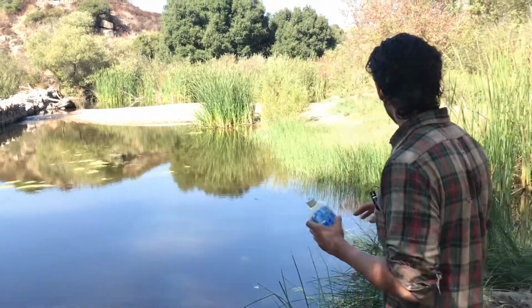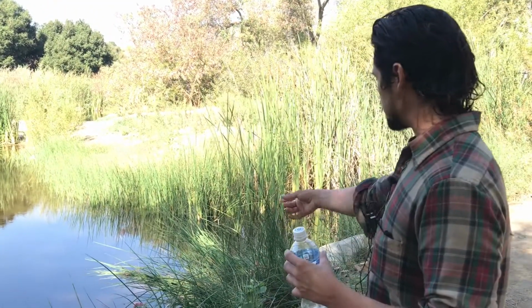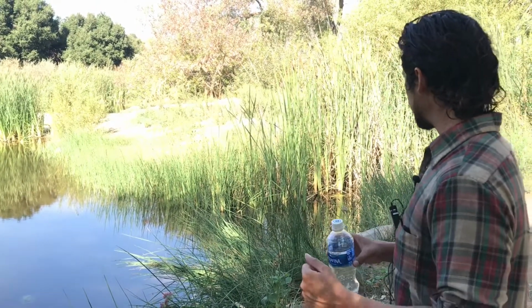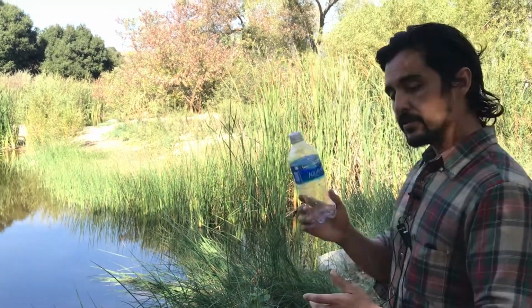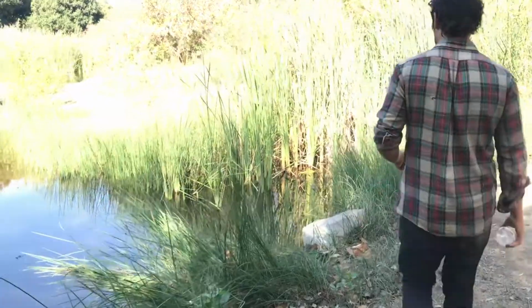And so for that, I'm going to move over here to the right where we have some plant growth and we can see some algae growing. This to me is going to be a good spot to find microorganisms. Maybe I can even find an underwater rock that has some algae growing on it and scrape a little off of that, things like that. So get your container and go to the edge of the water.